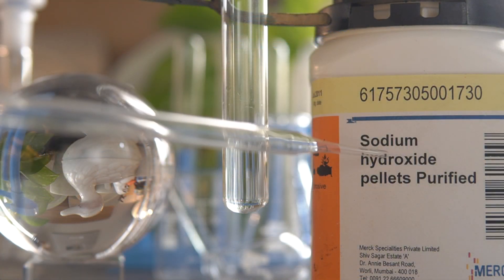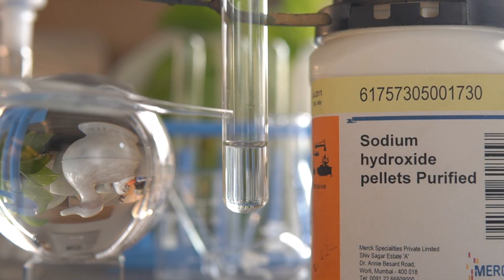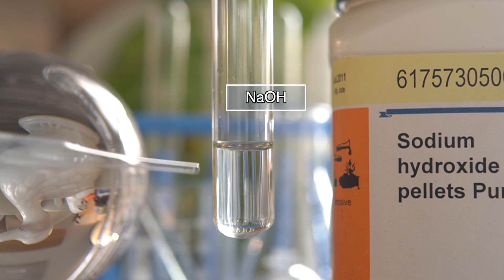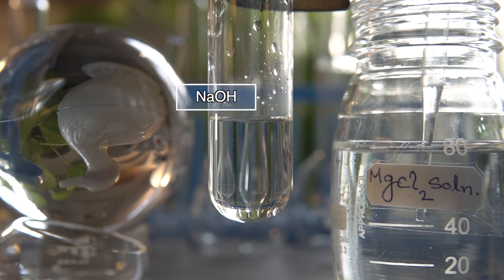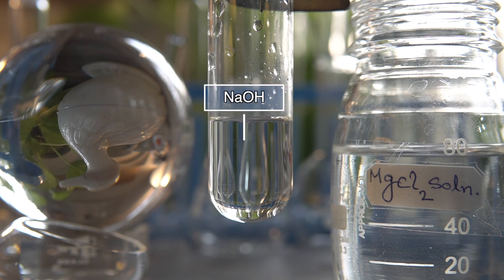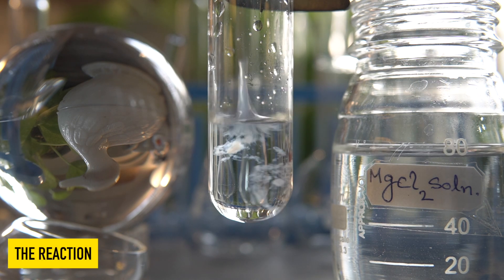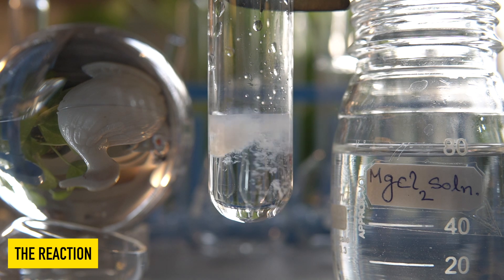Now, to initiate the reaction, we will take some amount of sodium hydroxide solution into this test tube. Now, we will add magnesium chloride solution into the sodium hydroxide solution slowly and observe the effect.